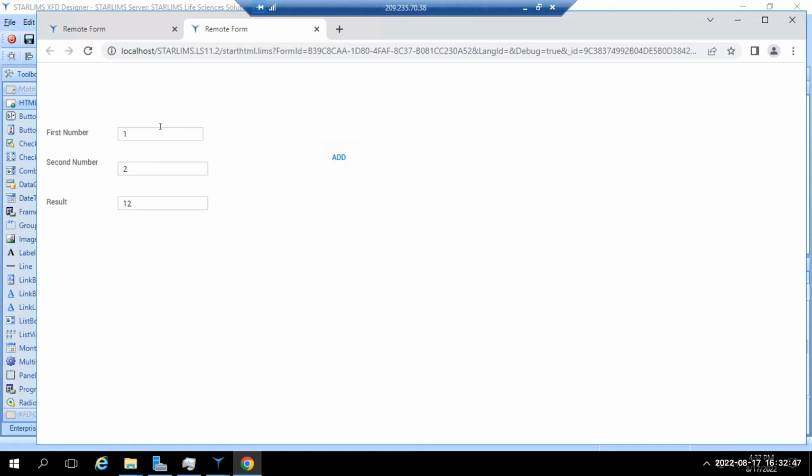But try to put ABC like we did before. Yeah, okay. So you see it's preventing you even from clicking add, right? If you try to click somewhere else, it doesn't let you. It's stuck, right? So you can hit escape. And then, okay, so that's one issue. That's better. At least you can type in ABC and try to add ABC. But we need to fix why we're adding as strings, right?